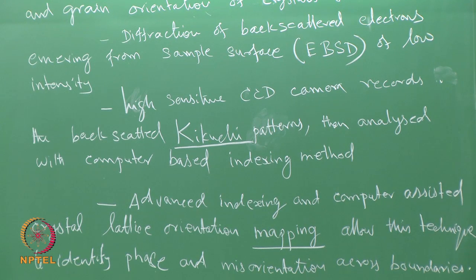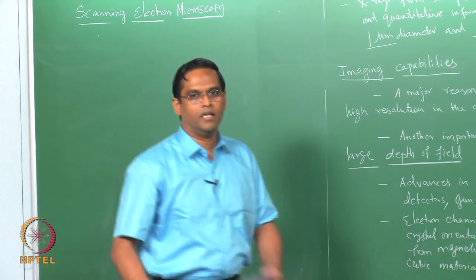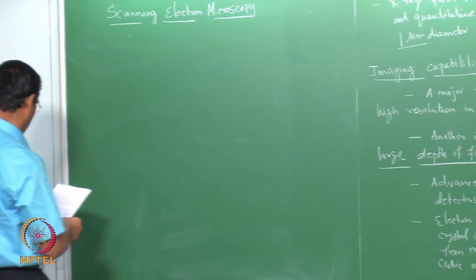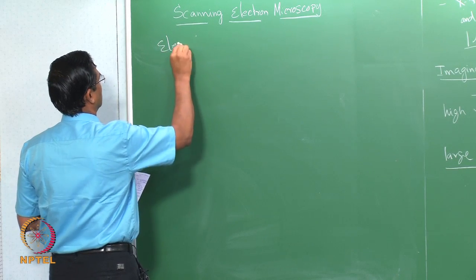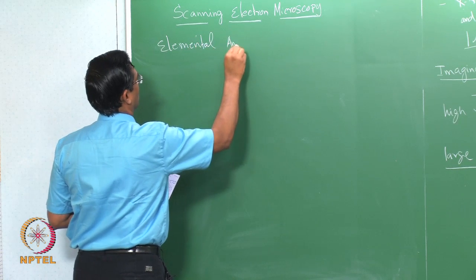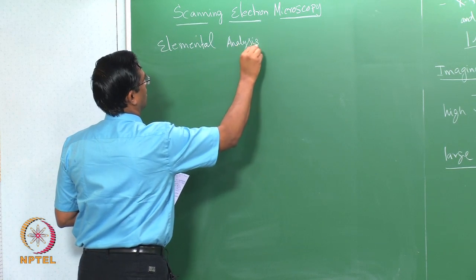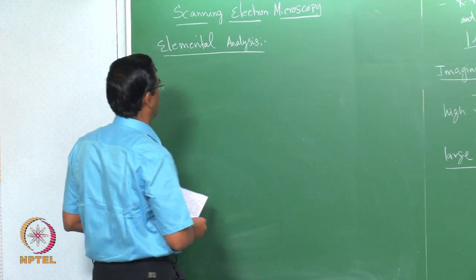So far we have seen imaging capabilities, structural analysis, and finally elemental analysis.